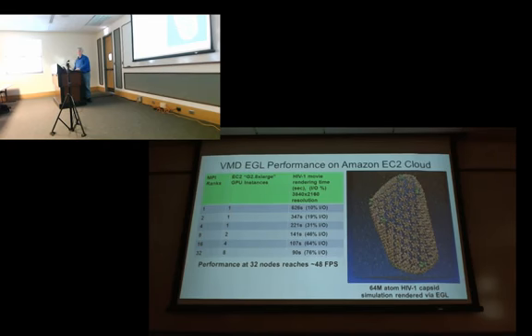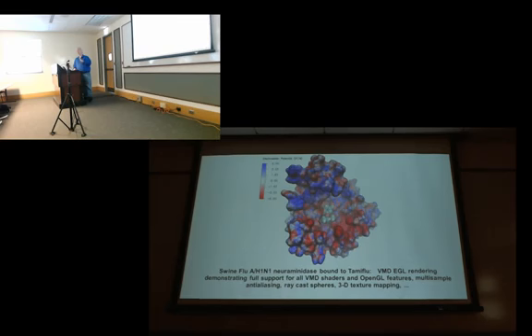So this is an image that was done using just OpenGL, using a special interface called EGL. You will have seen after you run through the tutorial today, you'll know how to use VMD interactively, but VMD can be run in a batch mode, and you can render images from scripts without interacting with the program at all.